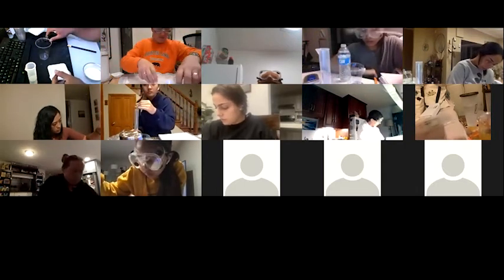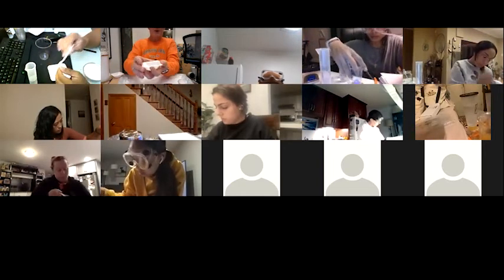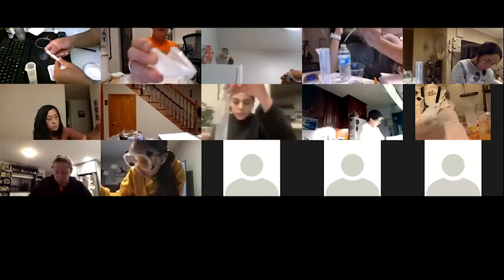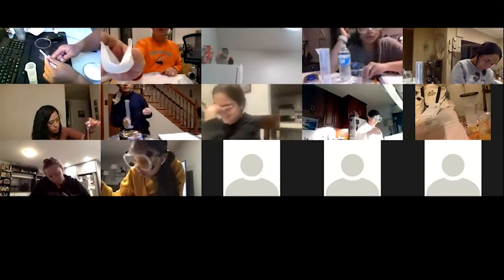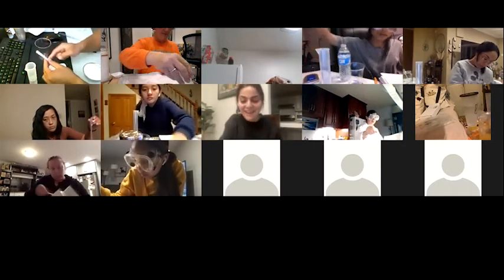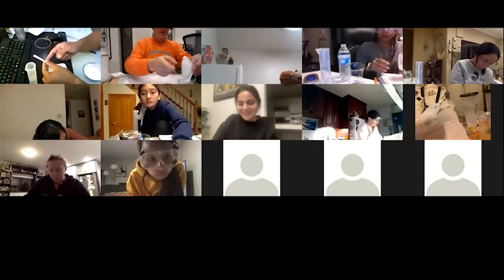All right, so now that I have my 5 grams of sugar, the nice thing about these weigh boats is you can bend them. When you bend them, you make a nice scoop to dump it out. And then just dump it. You can even tap it a little bit to make sure you get all of it out.